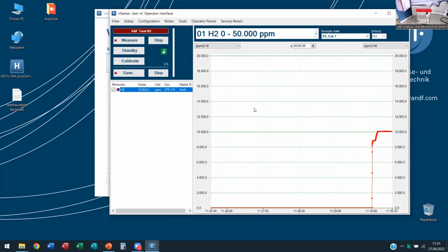And when we go back to the sample with pump board, we will run ambient air again. We should see that the measurement value pretty much immediately decreases back down to the low level. There are multiple ways this instrument can be calibrated. Since I have done the calibration this morning, everything is all right. We are providing 10,000 ppm, and we are reading 10,000 ppm.